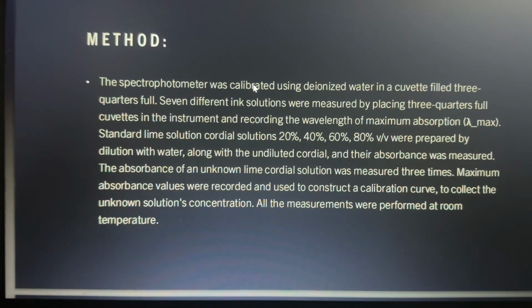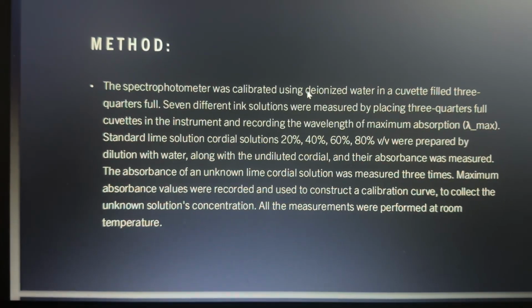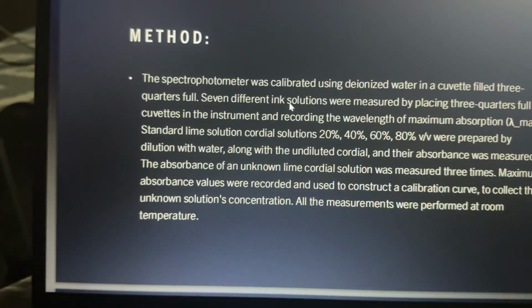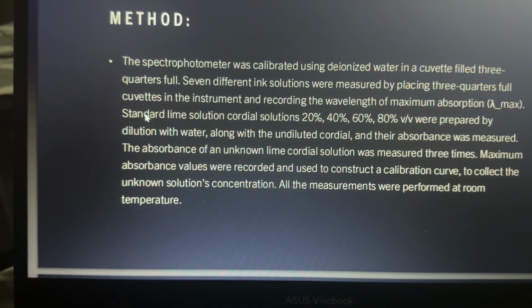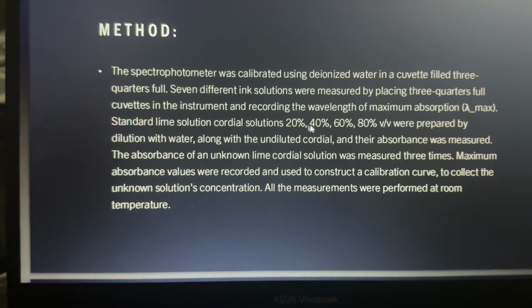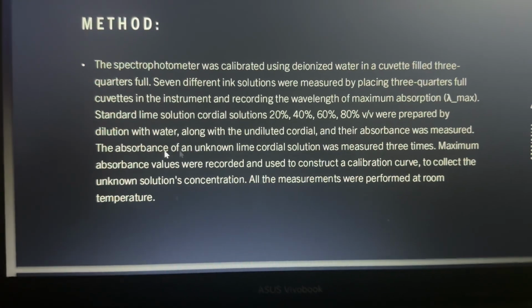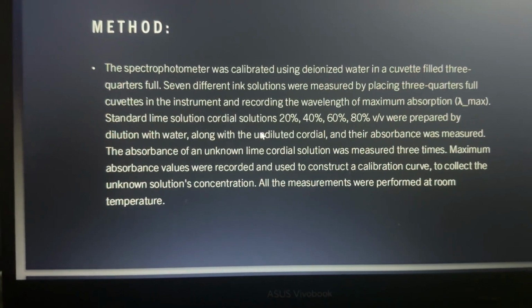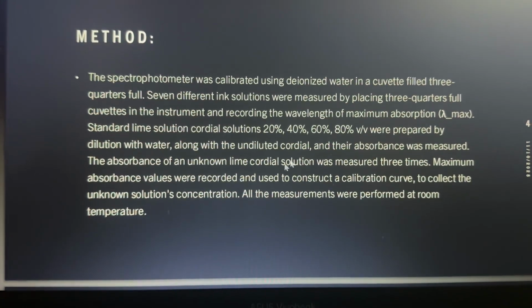So we calibrated using deionized water in a cuvette. We were given 7 different ink solutions and a standard lime solution. Cordials of 20%, 40%, 60%, and 80% were prepared via dilution with water, along with an undiluted cordial, and the absorbance was measured.